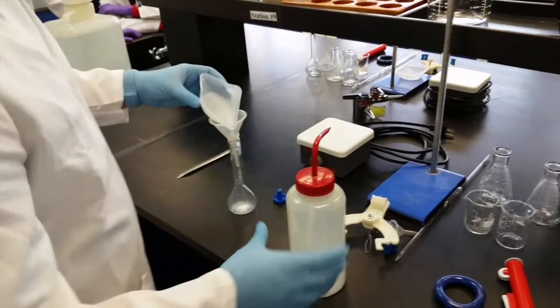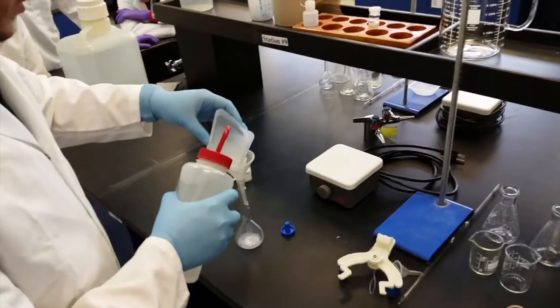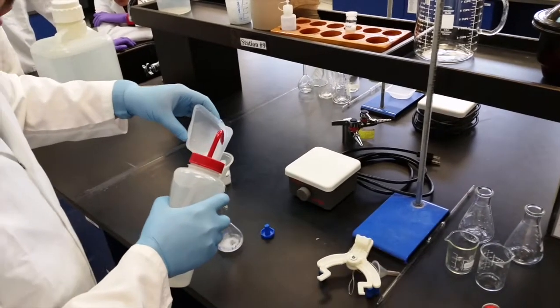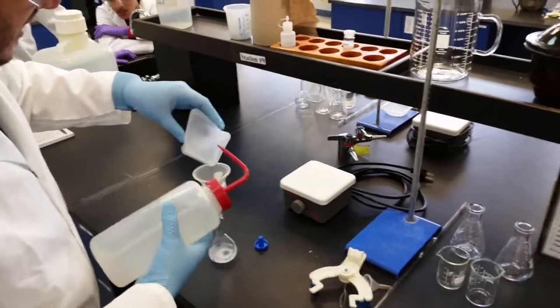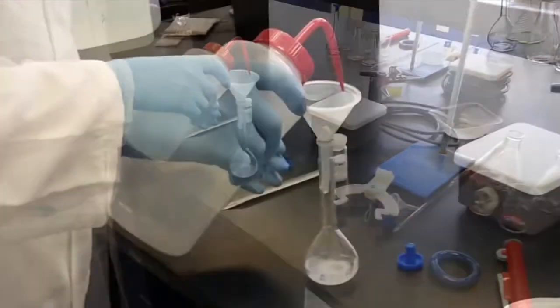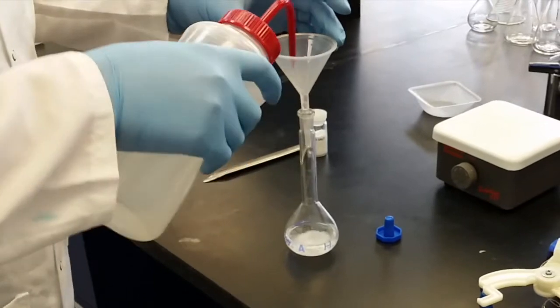Some of the solid will stay on the dish, so we can simply wash it with water. Wash all the solid with water to make sure that all the acid salt is inside our solution.